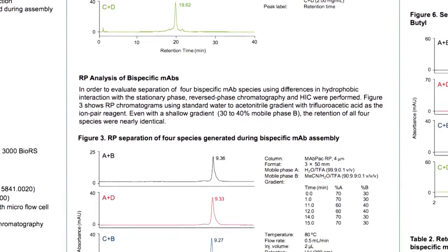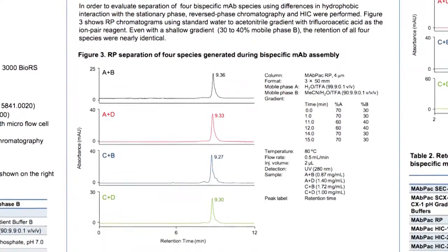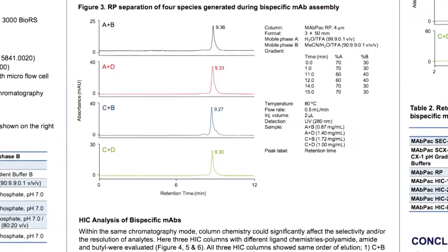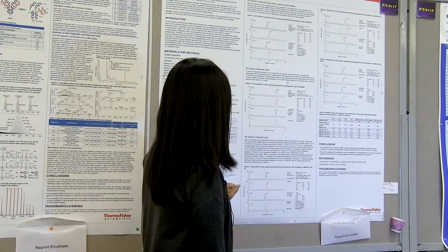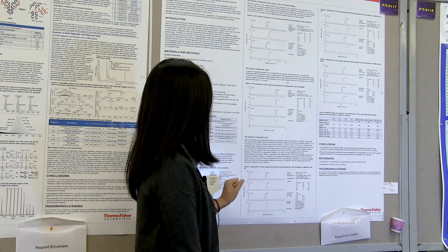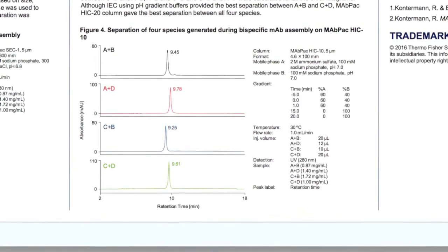So again, we tried to separate it with a standard reverse phase condition. And here, again, we weren't able to separate these samples with this mode. Then we decided to try our HIC columns. We actually have three different chemistries with the HIC column.